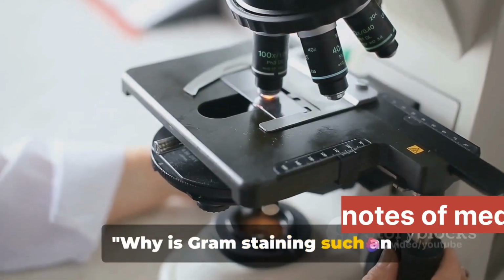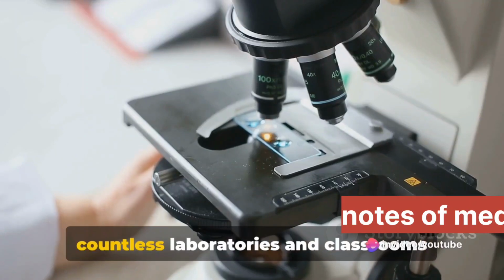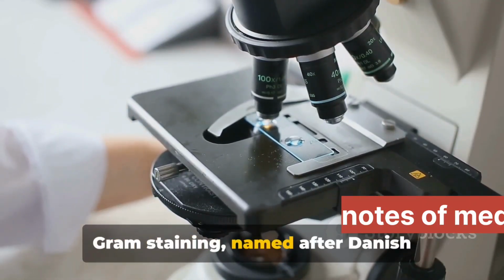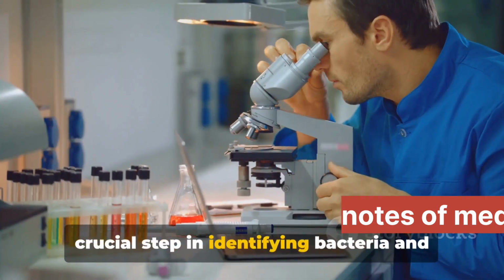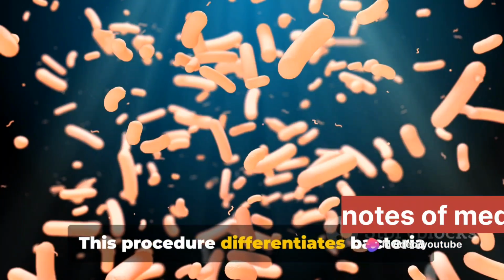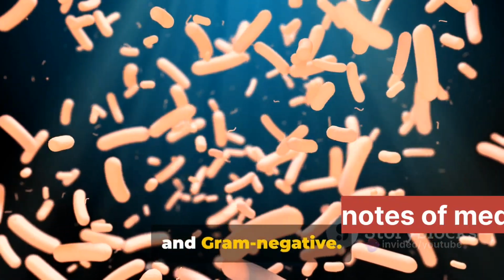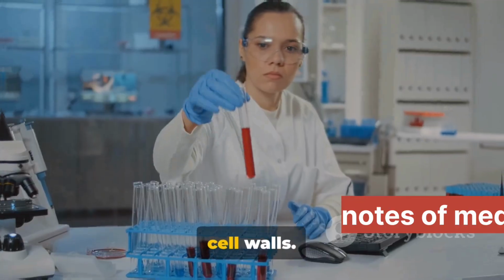Why is Gram staining such an indispensable technique in microbiology? That's a question that has echoed through countless laboratories and classrooms around the globe. Gram staining, named after Danish bacteriologist Hans Christian Gram, is a crucial step in identifying bacteria and understanding their characteristics. This procedure differentiates bacteria into two fundamental groups, gram-positive and gram-negative. This differentiation is based on the chemical and physical properties of their cell walls.